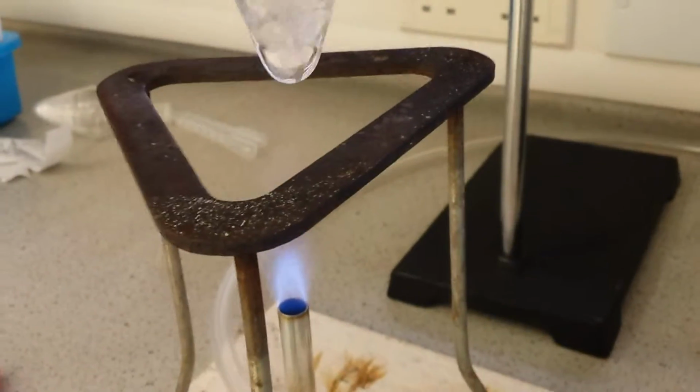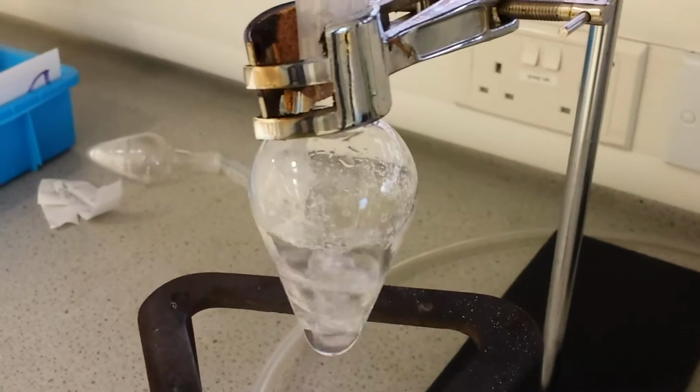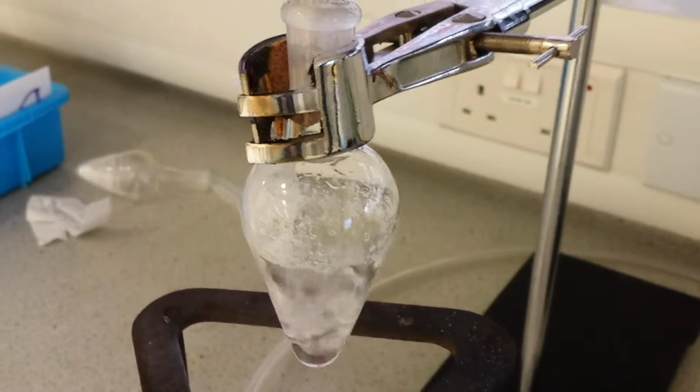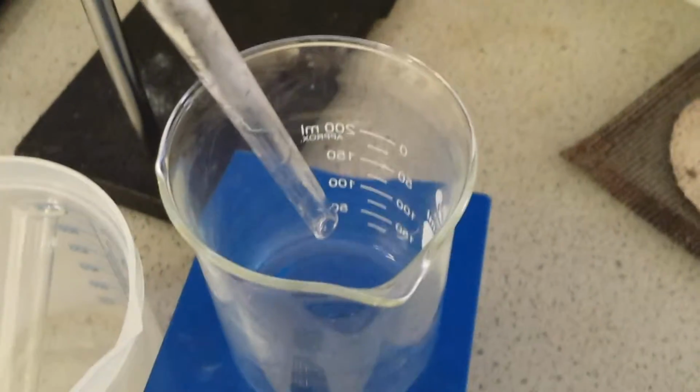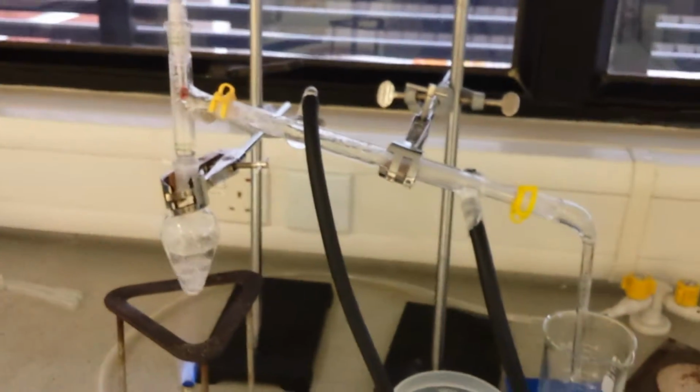So this one is almost boiled down. And you can see there's a lot of white substances, and then we have a lot of liquid dripping into the beaker. So basically that's what distillation is.